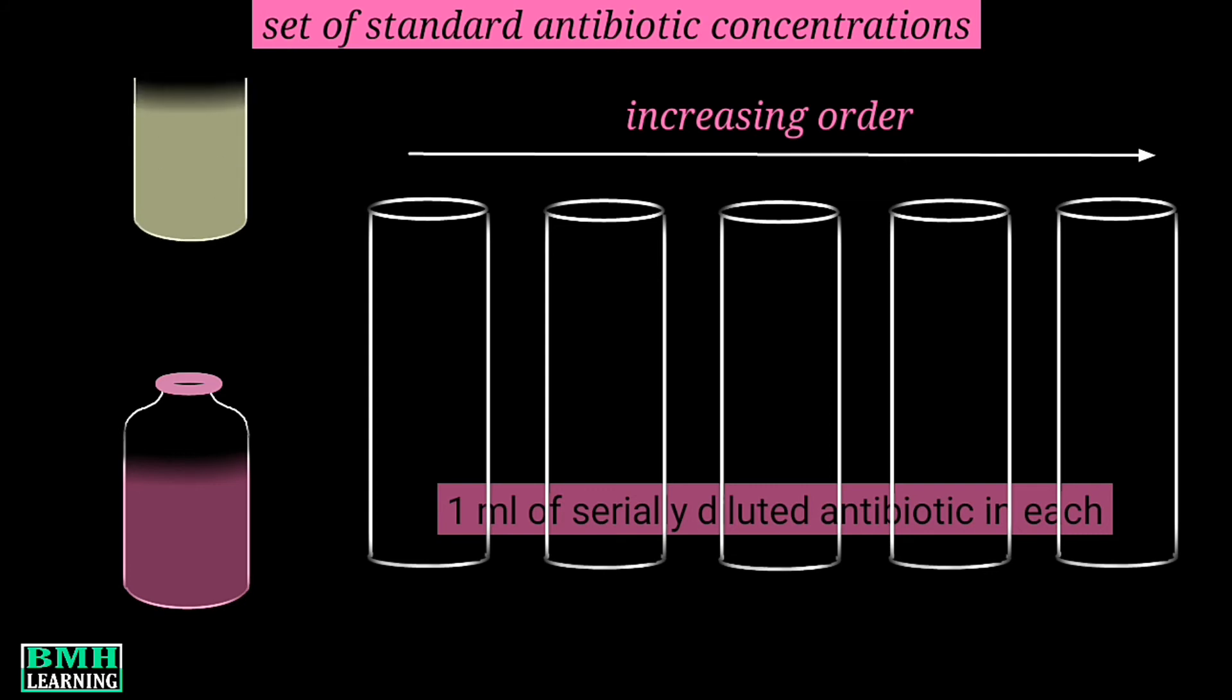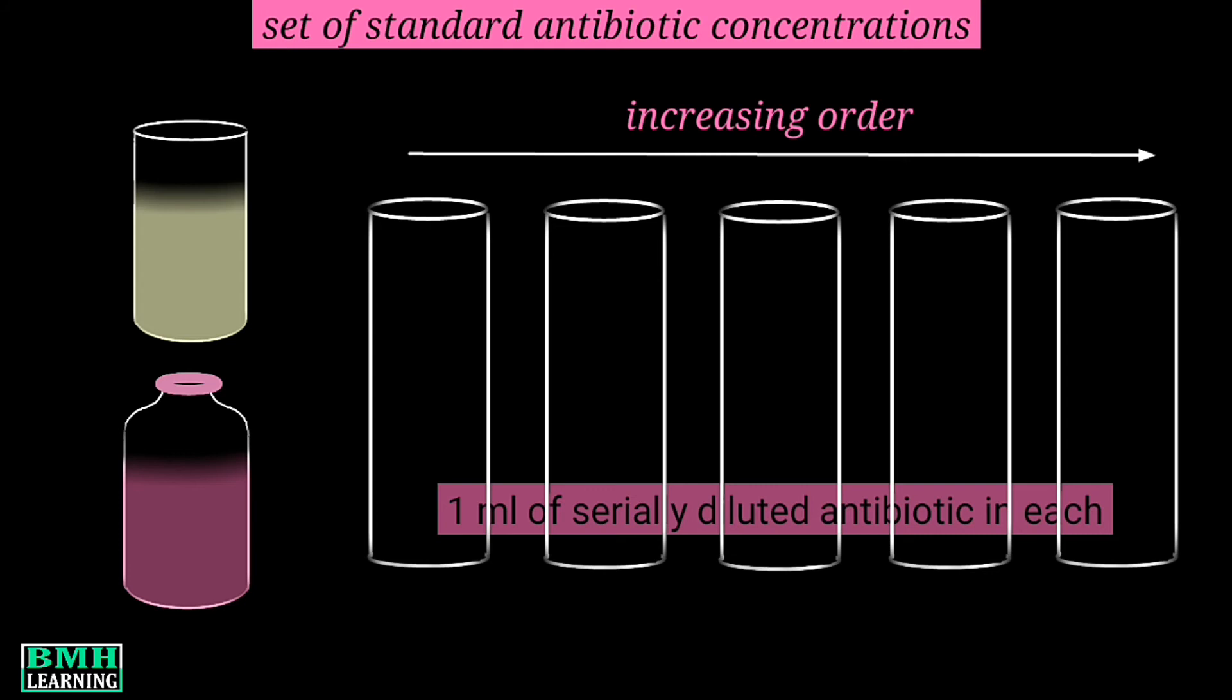Then we have a specific bacteria along with the nutrient media. We transfer nine ml of nutrient media with bacterial sample into these five tubes having different concentrations of standard antibiotic.